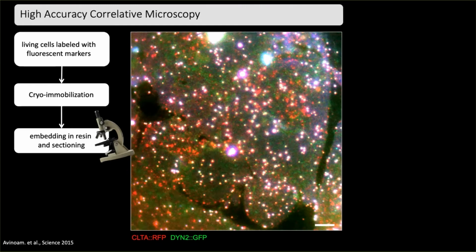If you do not require very high correlation precision, one could simply use objects like, for example, filopodia, the outlines of the cell, anything that is visible in the two imaging modalities. However, the beads give quite good correlation precision, and they're also quite unbiased in the sense that they are not part of the sample being examined. And the other thing that is readily apparent is these clathrin puncta.